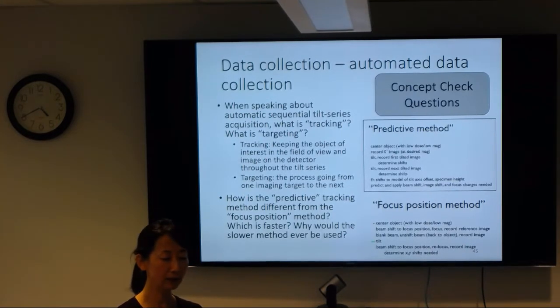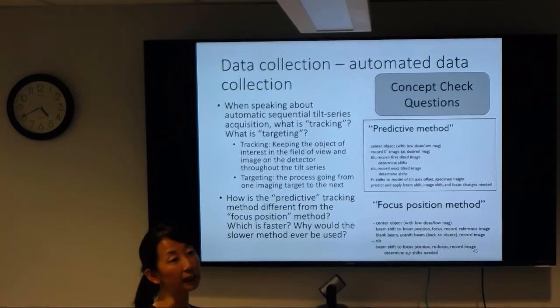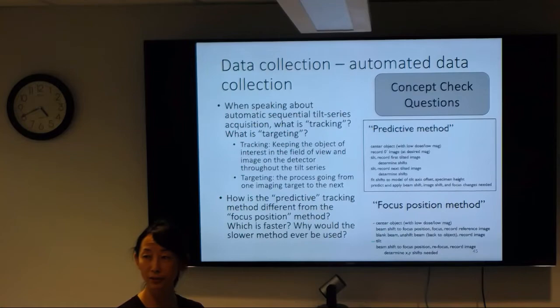And then Leginon is like that. So it's very fast. You want to have a very good microscope for that purpose, to make sure your prediction model is accurate enough from a very limited number of data points. All microscopes right now are pretty good for that purpose. Leginon is predictive. Yeah. All 300 kV microscopes.